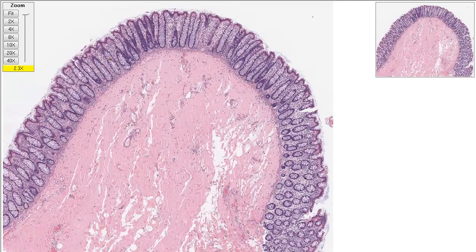This is Sal here, and I'm at Stanford Medical School with Dr. Andy Connolly. Hi there, Sal. I'm here with you to discuss histology today. Histology, and forgive me for what is probably a silly question, but what is histology? So it'll be the ology, study of, but in this case, histo means tissues. So we're going to be looking at the cellular components of organs.